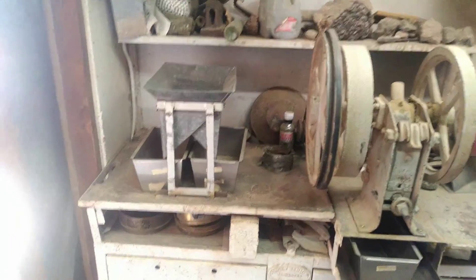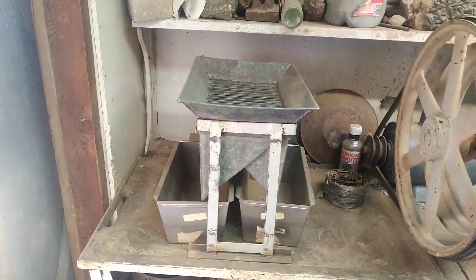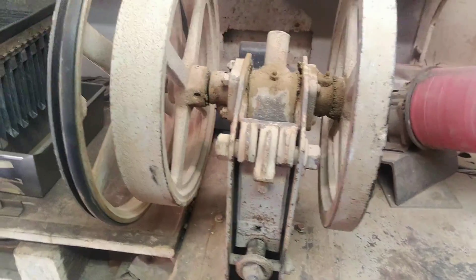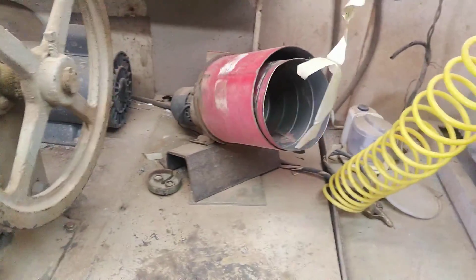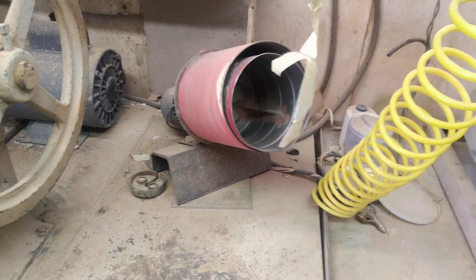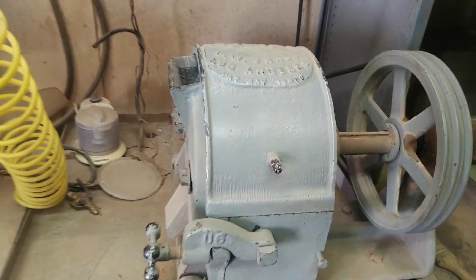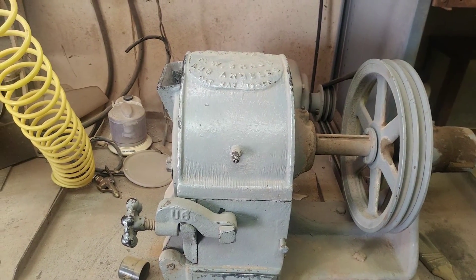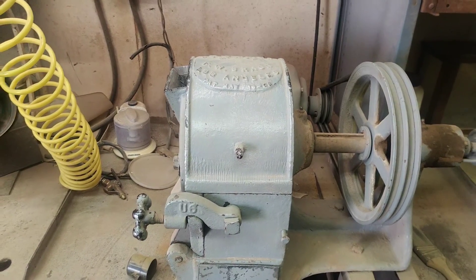From left to right here in the lab, we've got our riffle, our sample splitter, our chipmunk jaw crusher for finer work, our sample homogenizer — which is basically an agglomerator — and a pulverizer, which is for really fine work. We don't take it down too far, maybe 50 mesh.